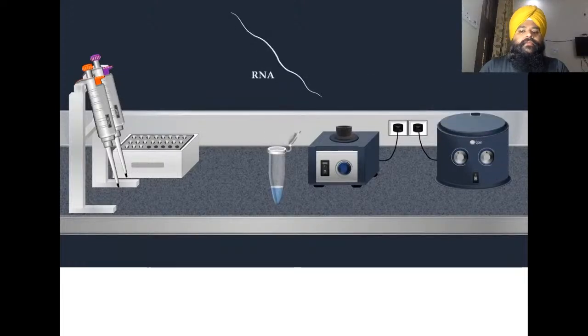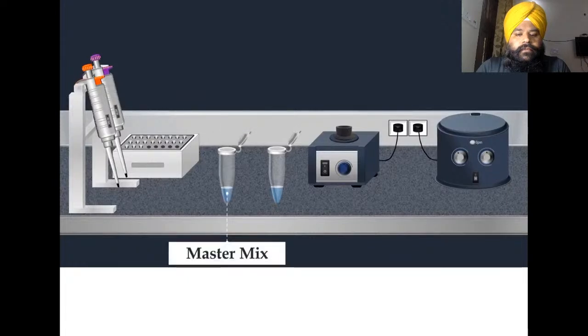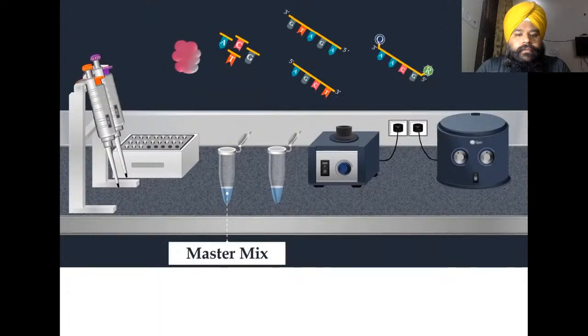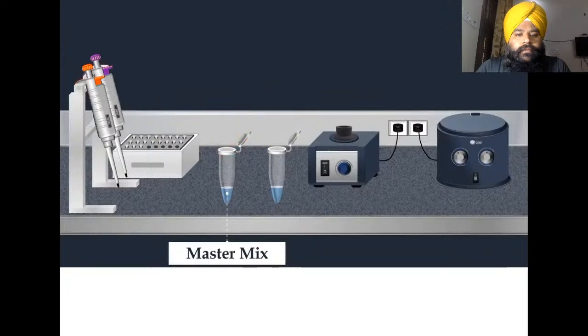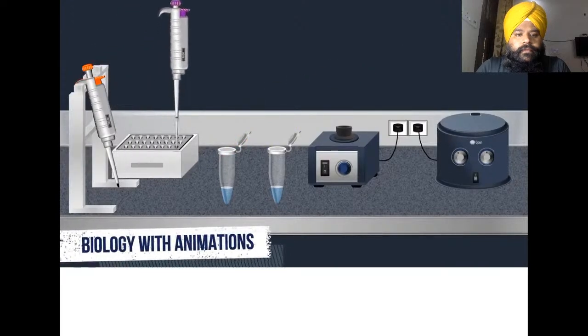After the extraction of the viral RNA, the next step is the preparation of the reaction mixture for PCR amplification. In this step, a master mix is used, which is a premixed concentrated solution that consists of buffer, reverse transcriptase enzyme, nucleotides, forward primer, reverse primer, TaqMan probe, and DNA polymerase. Finally, to complete this reaction mixture, the RNA template is added.